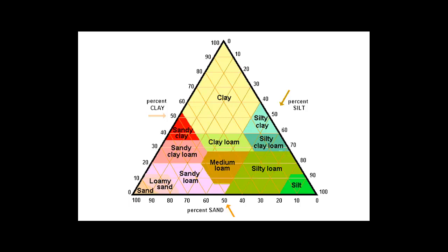Today I want to introduce this concept of soil texture to you and quickly demonstrate how we're going to find the texture of the soils that we collected. Soil texture refers to how the soil feels, and that soil feel is determined by the percentage of sand, silt, and clay within a given sample.